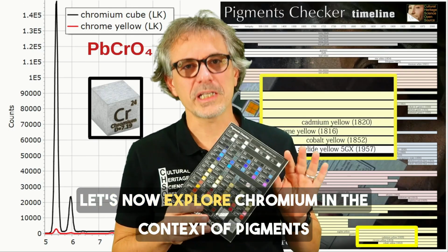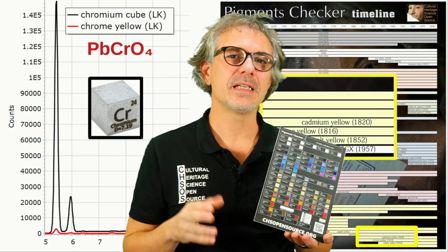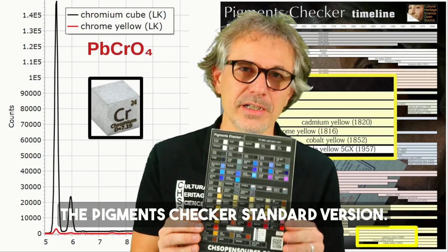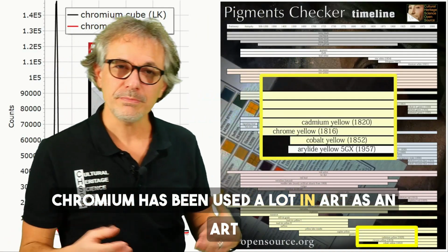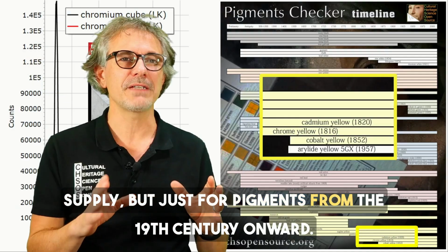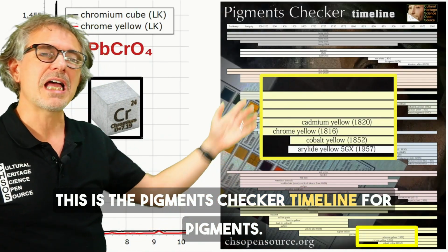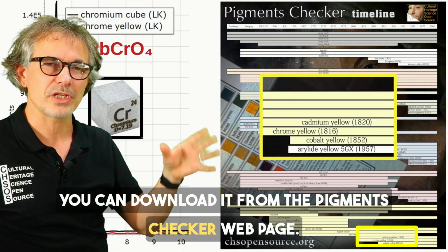Let's now explore chromium in the context of pigments until the 1950s, those contained in the Pigment Checker standard version. Chromium has been used a lot in art as an art supply, but just for pigments from the 19th century onward. This is the Pigment Checker timeline for pigments. You can download it from the Pigments Checker webpage.